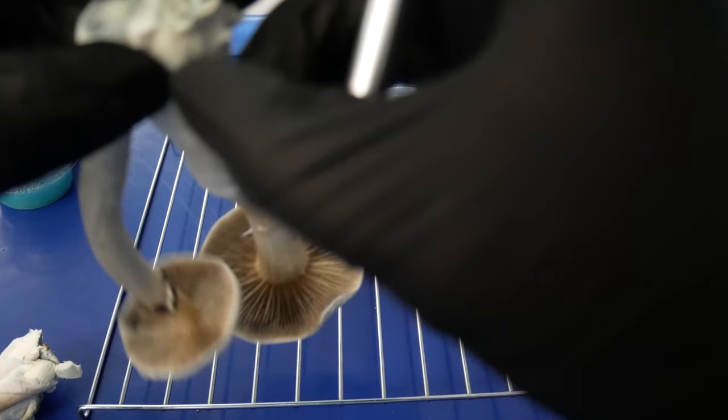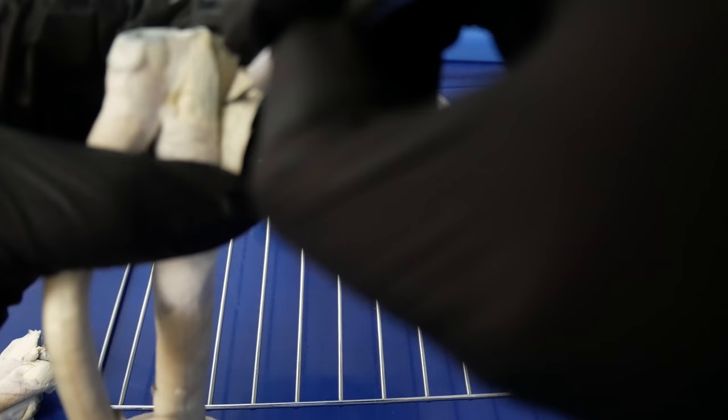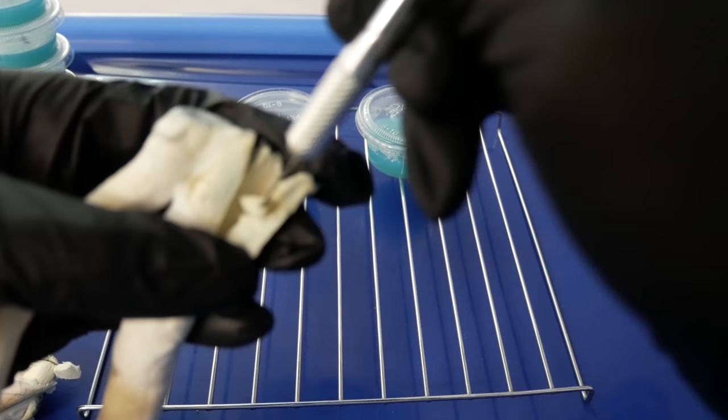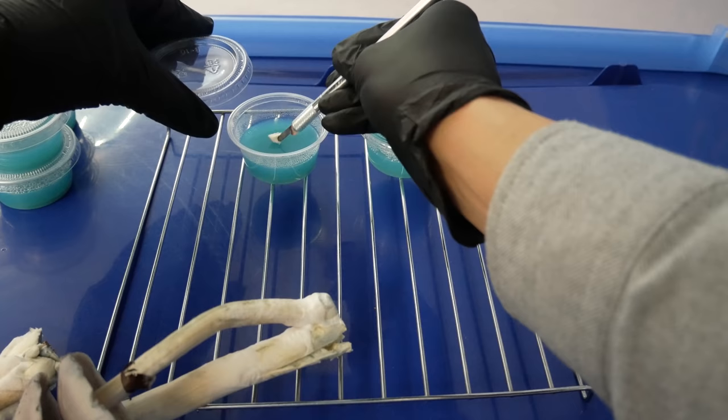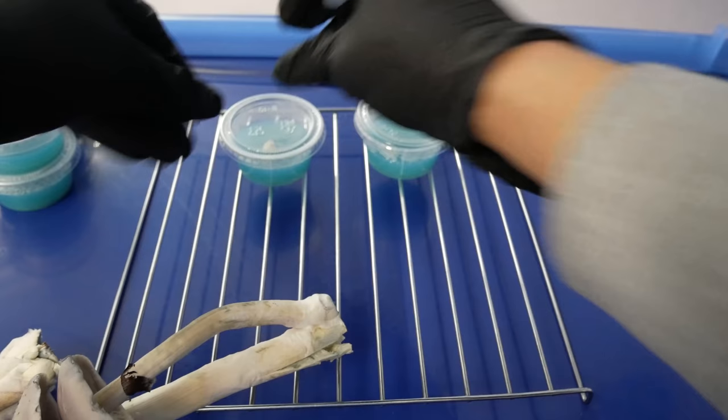And we split this down from the middle. Exposing clean mycelium. And we'll cut out a piece of sample here. Very gently. Once we have our tissue, go ahead and place this on our agar. And we'll repeat the process for as many times as you like.